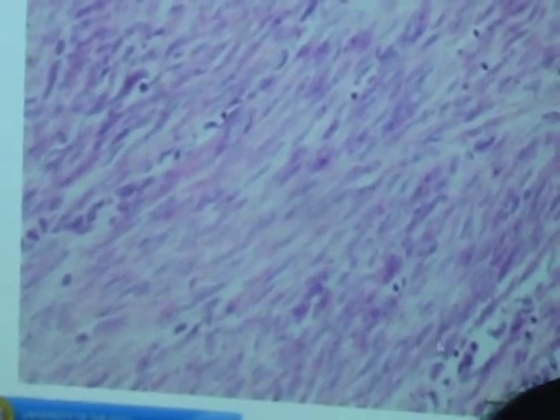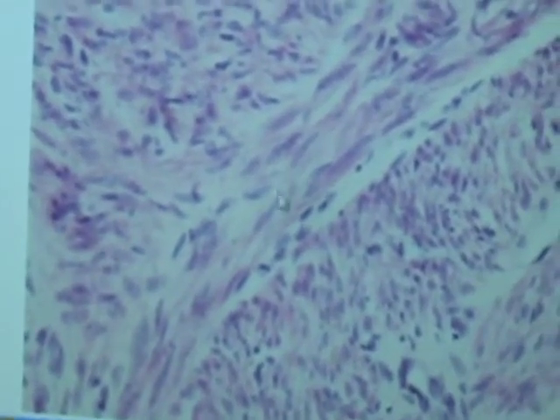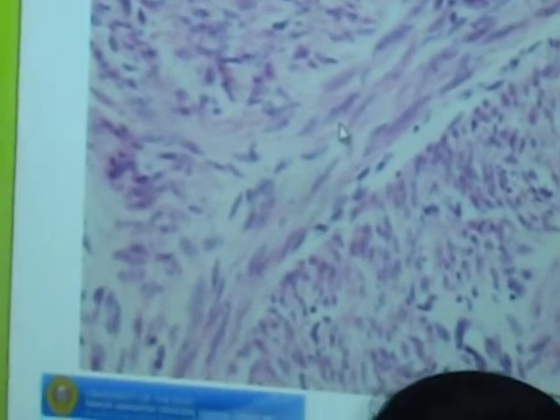From a reproductive organ, female reproductive organ. These are the two layers, but we will look at this layer. Classify pointed tissue. That's the low power, this is the high power, still the high power. This is the cross section, this is the longitudinal section. Classify pointed tissue.